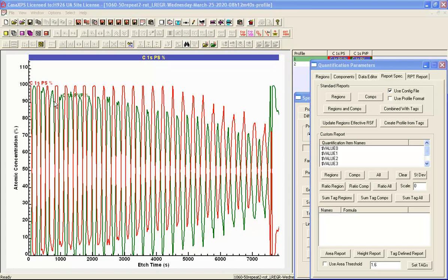This is because during a depth profile we are etching the surface, so the surface is changing. There's a charge neutralizer state because these are insulating materials. It's possible that at each interface there is some interplay between peak position, full width half maximum and intensity. That means that what we see here is not truly representative of how clean these interfaces actually are.